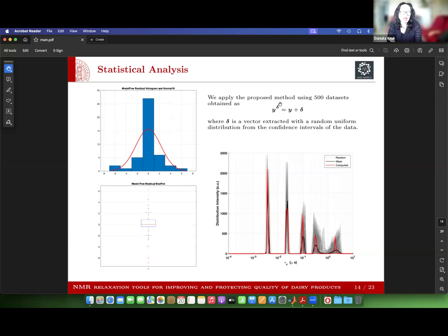Yeah, but we are thinking about a kind of limiting case. The peaks are very sharp and you somehow can take them out, but there are cases in between. Yes, of course. The case of this gadolinium, or even the cases I presented yesterday with iron, this broad relaxation enhancement in the high frequency region is clearly broader, and it is clearly seen above what we could imagine as a background curve underlying this behavior. I don't know. It's just a comment.